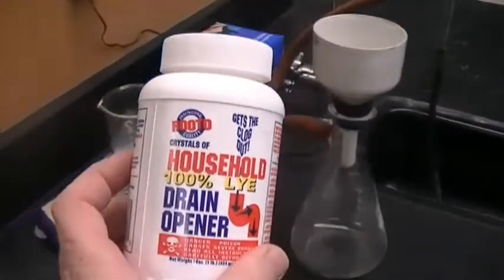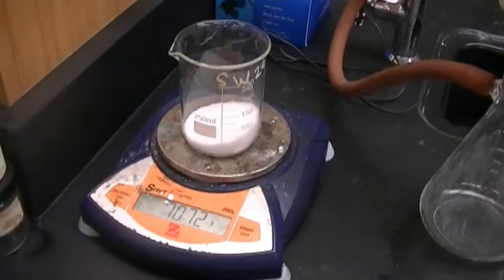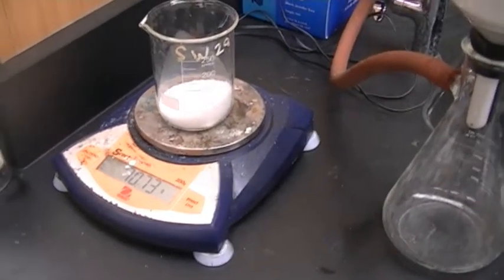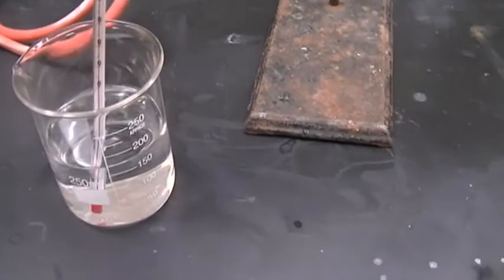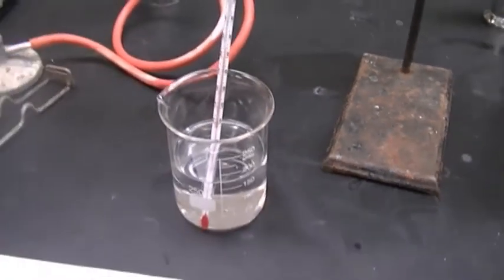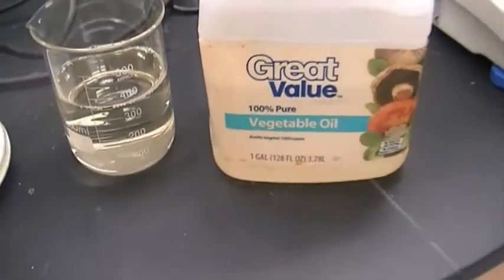Alright, so here I have taken my household lye, 100% lye drain cleaner, and I measured out 70 grams, and it's been sitting here a little bit and it's been absorbing some water, but we have 70 grams of lye, which is sodium hydroxide. And in this beaker I have 175 mL of water, and my starting temperature is about 25.8 degrees Celsius. And then over here I have my vegetable oil. I have 350 mL of my vegetable oil.